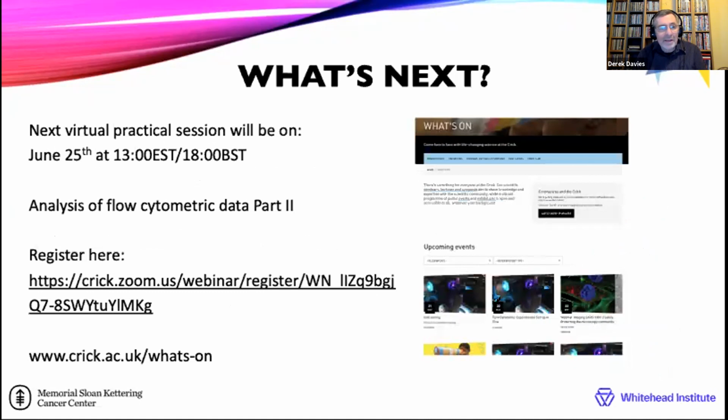And we're going to look again at flow cytometric data analysis. We will be using a different program. We'll use FCS Express in that one, and we'll look at a couple of different types of analysis.